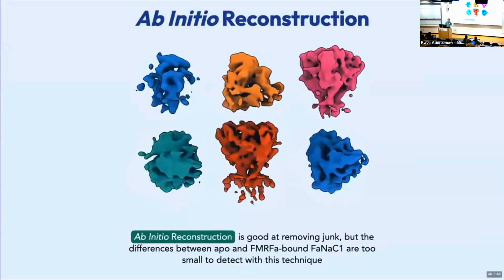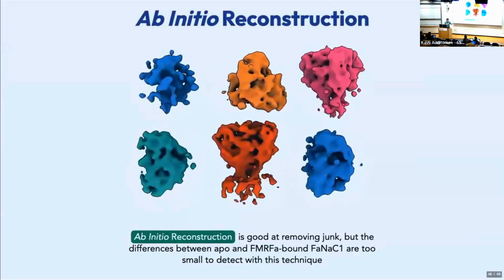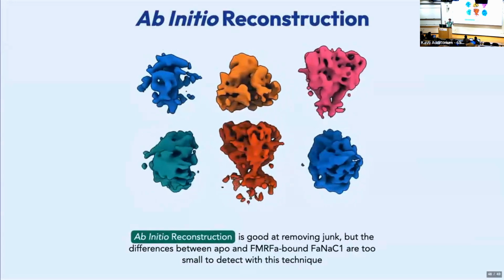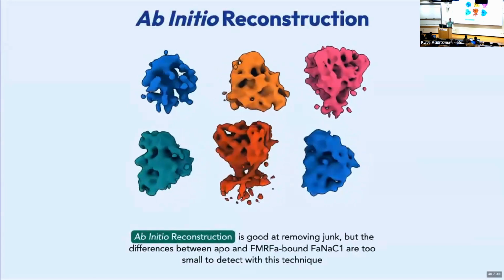It does exactly what you'd want, but at that point, why not just run a heterogeneous refinement in the first place? I'm just showing you this to emphasize that in some cases those two jobs can do very similar things, but they are really built to do different things. They operate in different domains, right?